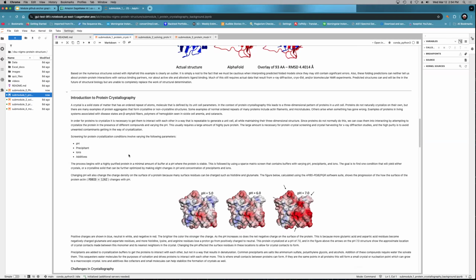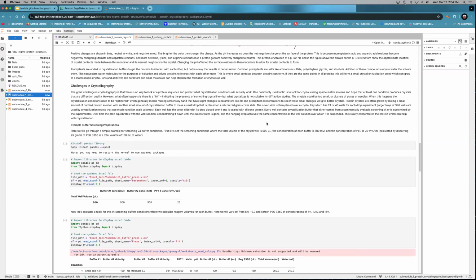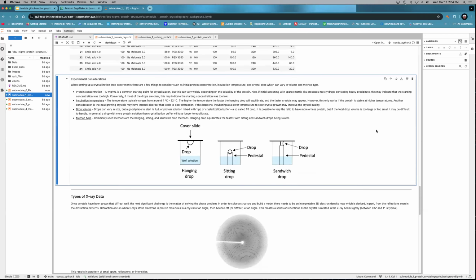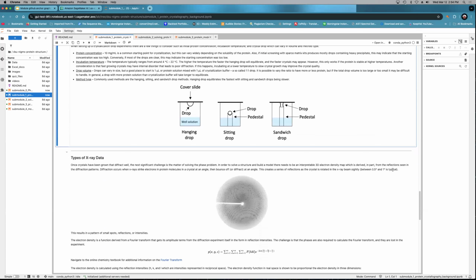And so there are some considerations we have to think about in terms of how to crystallize a protein. And of course, when you do that, there's an art to it. Many people have thought of it as being an art. You've seen examples of two graduate students or two postdocs working on a research project. They're both trying to crystallize something or have in the past, and one person is successful and one isn't.